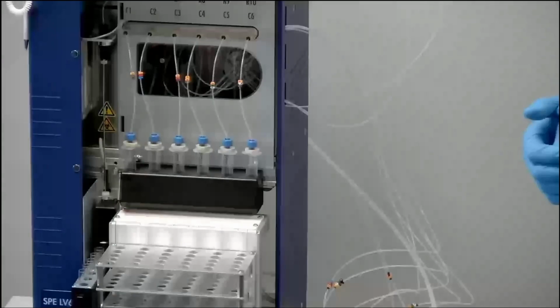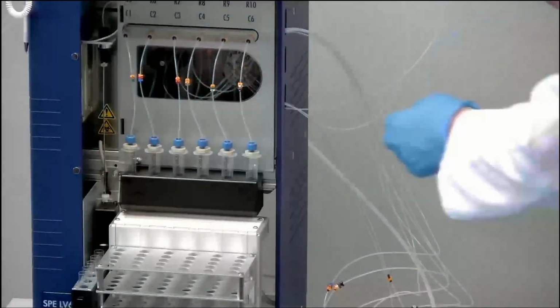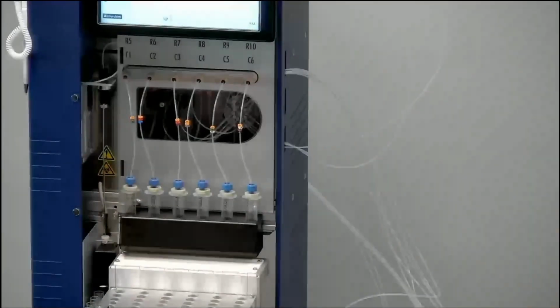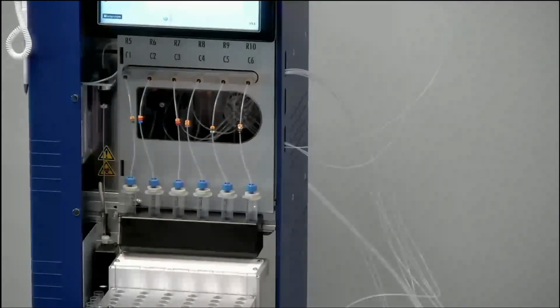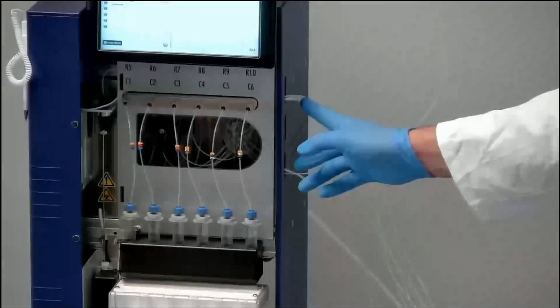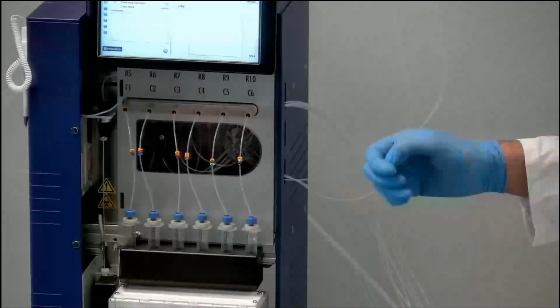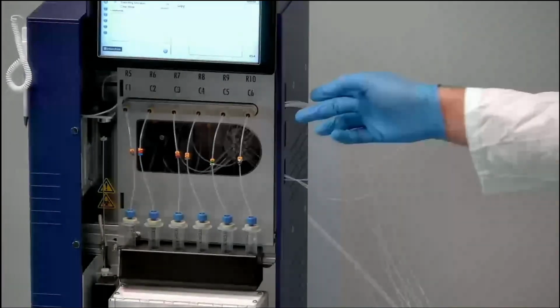In the other case, if I use the autosampler, I can use 10 different solvents. So different possibilities. 4 solvents is enough, especially for water analysis, for example. That's why the system will configure your line automatically, depending on whether you want to use the autosampler for small volumes or large volumes, like 1 liter, for example, with these tubings.